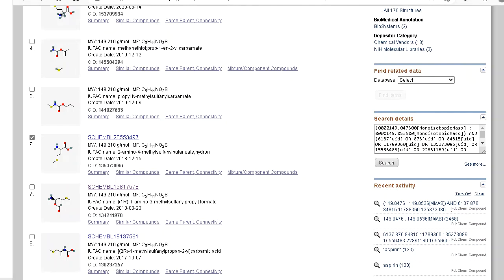The Excel add-in demonstrates the uncertainty in mass spectral data even for a simple compound like methionine. However, combining the analysis of mass spectral data with background information about the analyte's history is usually sufficient to tentatively identify a compound.